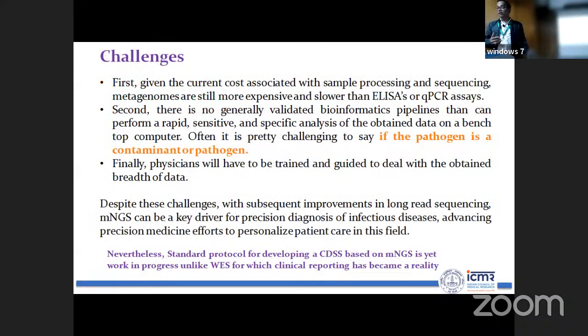As I mentioned, it has challenges, like you never know whether it is a contaminant or a real microbe. You should have enough skill to differentiate that, point number one, and that comes with practice. I cannot say that verbally. Once you are doing enough analysis, you will get an idea: these are likely to be contaminants and these are likely not contaminants.